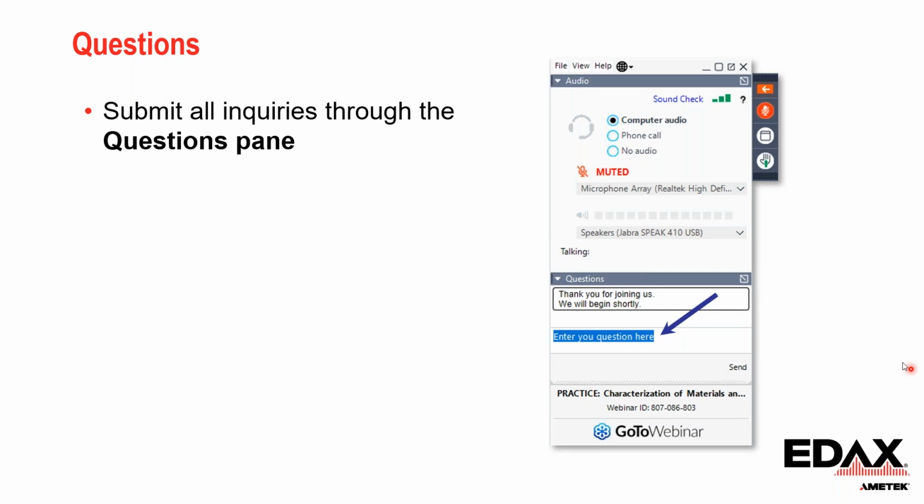This question is, are there any new features or major bug fixes for EBSD and EDS in Apex 3? We are always fixing bugs. Yes, we have bug fixes for EBSD and EDS in Apex 3.0 and the next release, Apex 3.1. In Apex 3.1, we will implement new EDS and EBSD features.